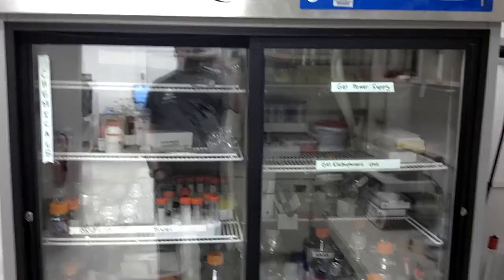Power supply. Refrigerator with more reagents. Another microwave. Don't cook in it though.